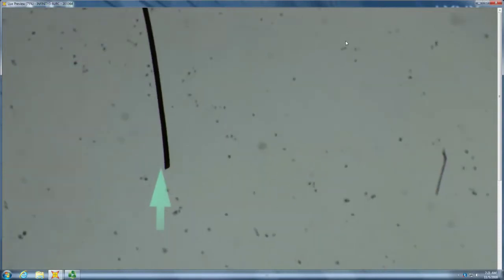Okay. So what are we looking at? A hair, yes. And tell me what happened to this end of the hair. It got a haircut, right. So that's cut as with barbers, scissors, right? So that's a normal cut hair. So now we're looking at the other end. And tell me about the other end of this hair. It appears to be tapered. It's tapered and it loses its pigment, right? So a tapered fracture is characteristic of what kind of things?